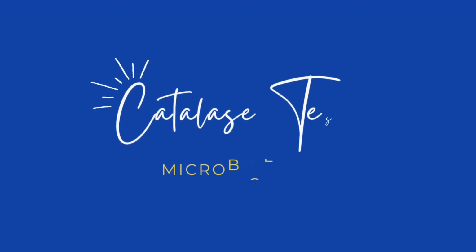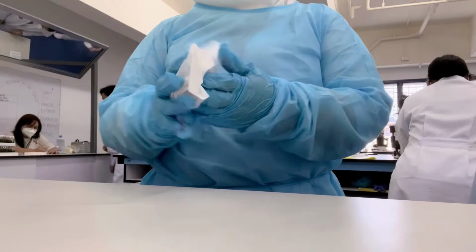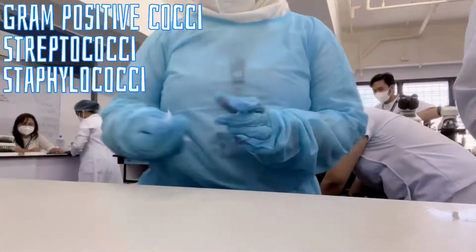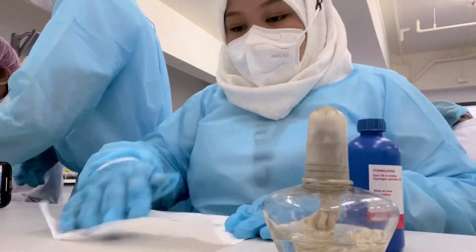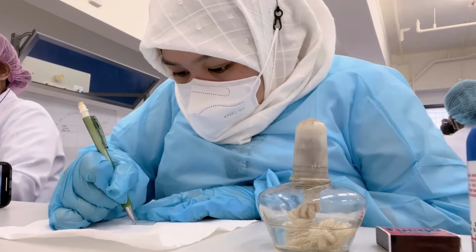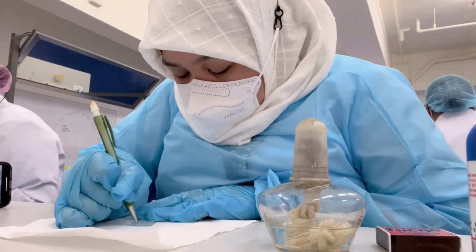Third is catalase test. Catalase test facilitates the detection of the enzyme catalase in the bacteria. Also, it is a particularly important test to determine whether the gram-positive cocci is a streptococci or a staphylococci. First is to prepare the materials that you will be using during the procedure. Next is to label the slide with the patient's name, date, and type of test.